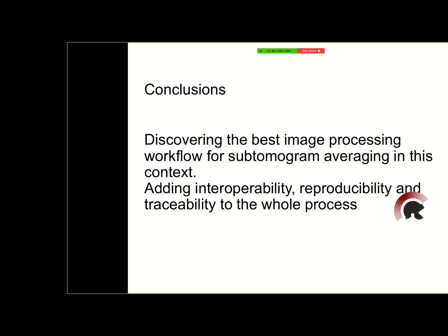So in conclusions, having everything integrated in a single platform is not only very convenient, as you can go from one package to the other in a very easy way, but it also adds a lot of scientific value because you can define better workflows. If you know that for this particular kind of data, Dynamo does this operation very well, and then XMIPP does this operation very well, and we can denoise with this other tool, this will result in much better imaging than just being constrained to a single tool.